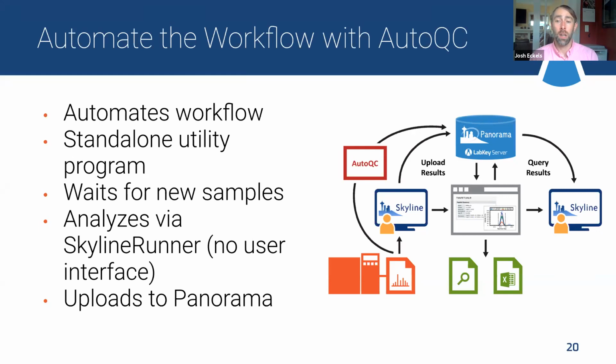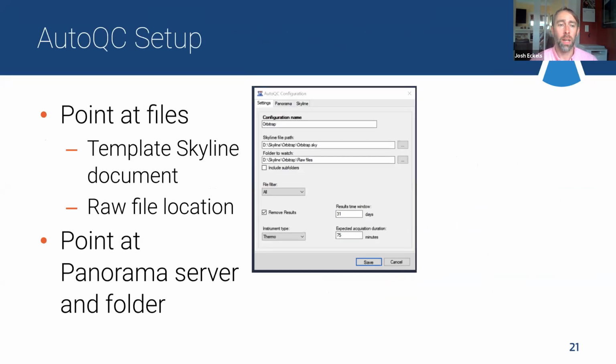So you don't need to open Skyline. There's no user interface needed, no user intervention required at all. And then it can automatically upload it to Panorama. And so really, this is what AutoQC looks like.